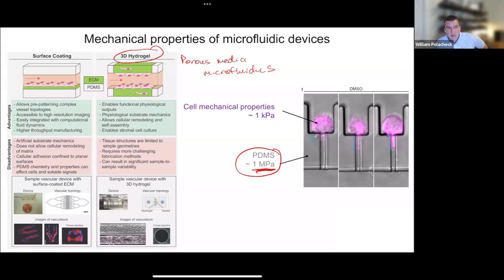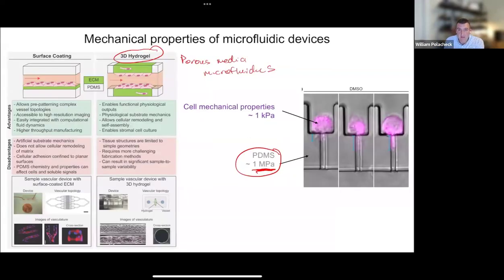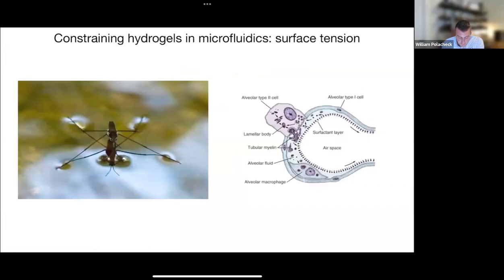And so it turns out that with microfluidics, we can leverage the pressure and flow resolution, the rapid reaction time, the low working volumes. And if we can integrate a three-dimensional hydrogel, then we end up with something that also has all the benefits of hydrogels, which include the things that you'll hear about in the next lecture, but things like physiologic compliance, the three-dimensional structure, cross-linking, reaction times, et cetera.